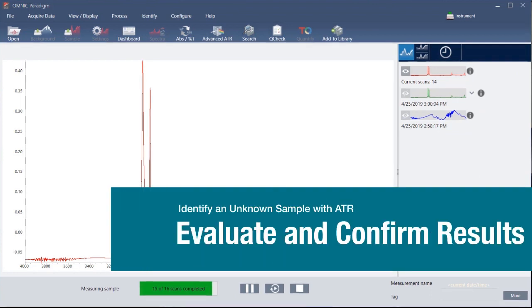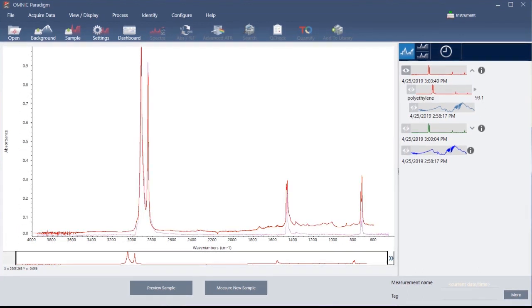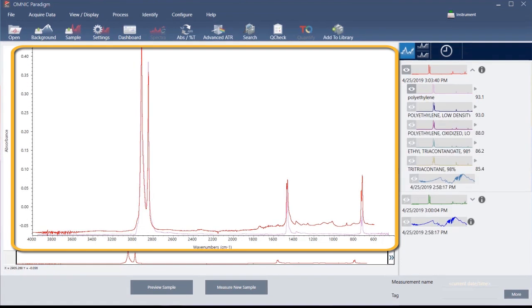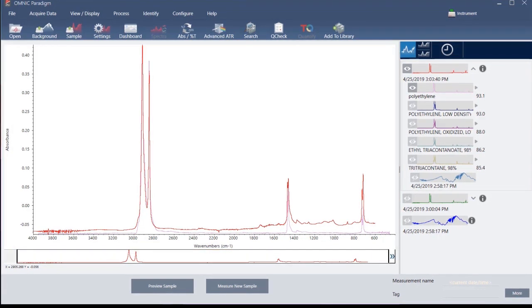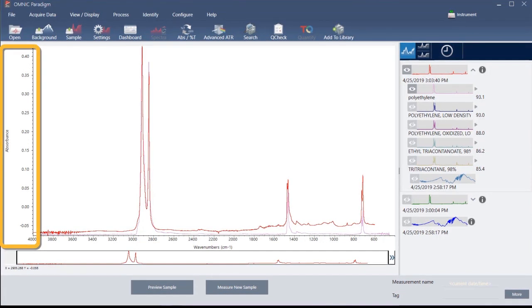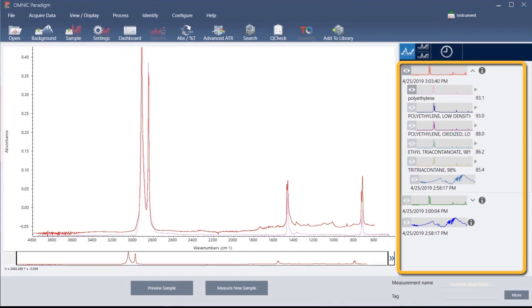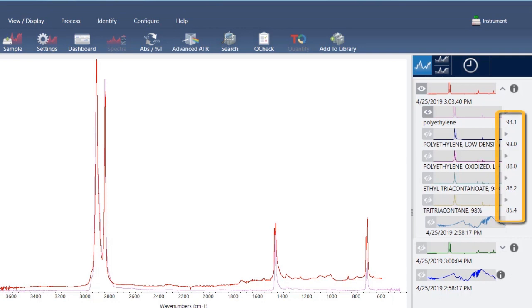The software quickly compares the sample spectrum to the selected library spectra and shows you the results. The spectral pane shows the sample spectrum along with the best matched spectrum from the selected libraries. The two spectra are overlaid with the same y-axis scale so you can compare the results visually. The results panel shows a list of the five best matched spectra along with their match values. The match values tell you how well each library spectrum matches the unknown sample. The closer this value is to 100, the better the match.